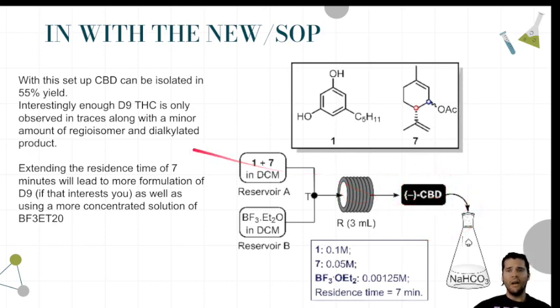Now, I really like this because 55% yield after I wash that with LLE, that's enough to isolate. Then I can isolate my CBD with an even less significant loss and be left with a product that was not only quick to produce. Guys, think about all the time that you take to take the biomass, extract it, solvent recovery, filtration, winterization, filtration, decarboxylation, distillation, isolation, washing, drying, all of your isolate. Think about that. It takes a long time, and that is kind of what is driving the price of those things up.